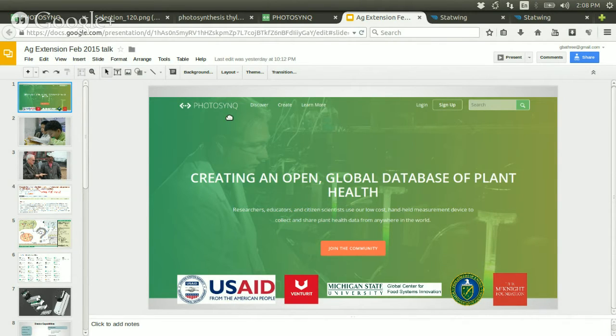So today I'm going to talk about PhotosynQ, which is a platform to enable anyone to quickly and easily create, share, and analyze plant health information globally. And I want to talk about some of our goals, what the concept is, what you can measure, and then I really just want to dig into applications for ag extension agents and even maybe create a quick project.